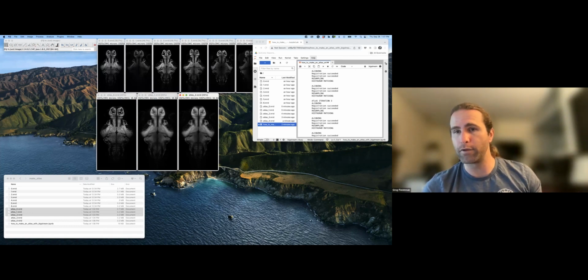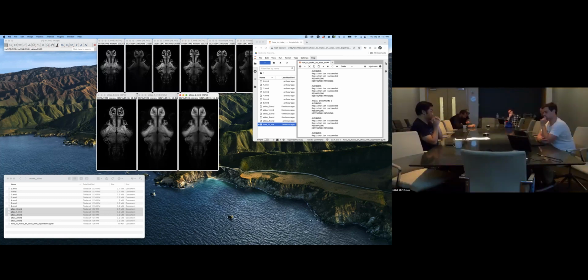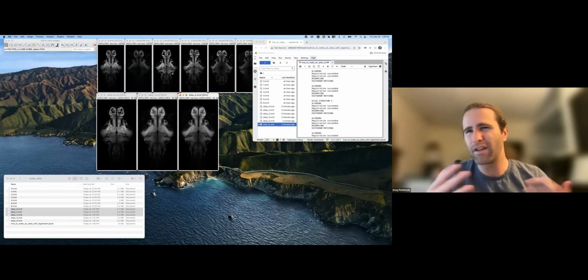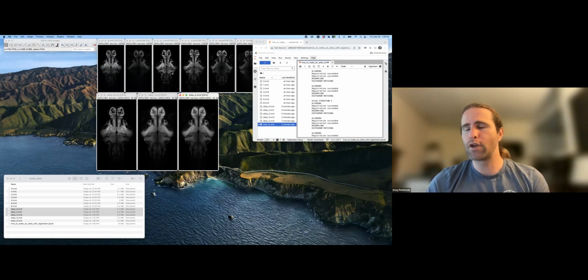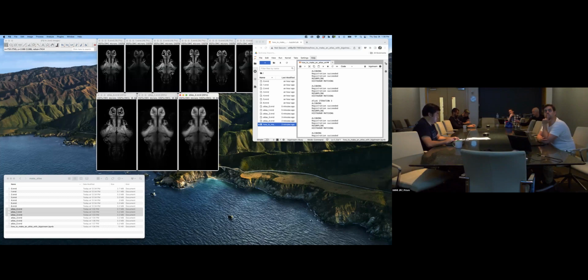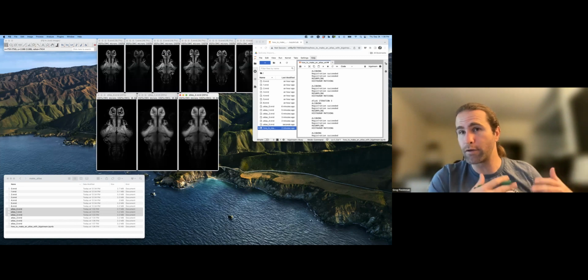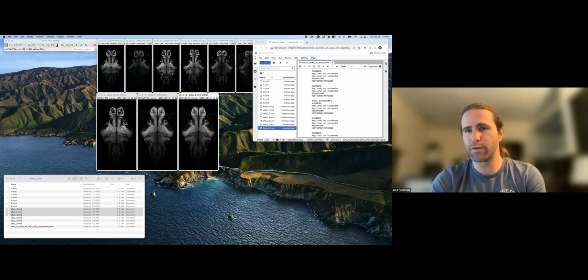That's an extreme example, but the same principle holds for subregions of the animal you're studying. If I had, say, half of these images only of the left hemisphere and half only of the hindbrain, it doesn't make sense to make an average from those things. So again, in the same vein as what I said about where the contrast agent or fluorescent marker is expressed, you can get creative with your own specific data set, even if you don't specifically adhere to the principle that all images have exactly the same content. You can still make some of this work. You just have to be more knowledgeable about what's going on.